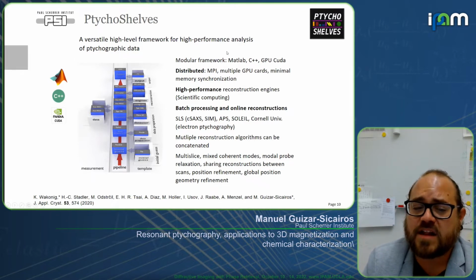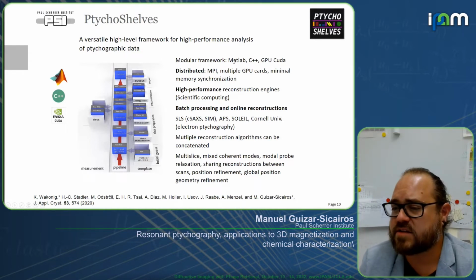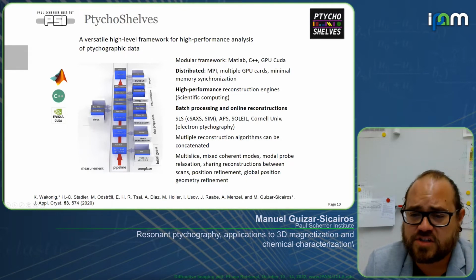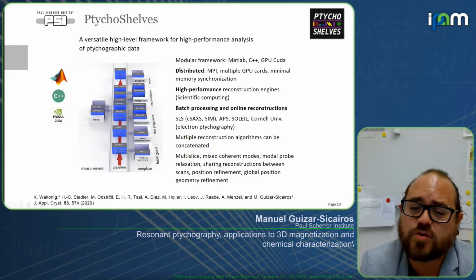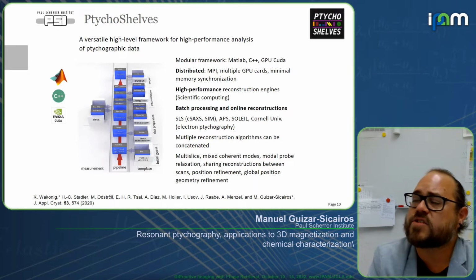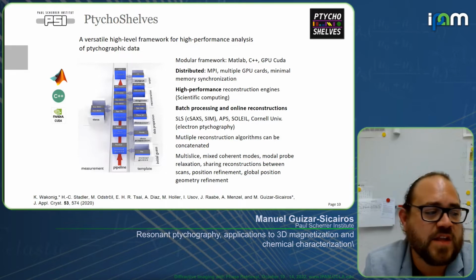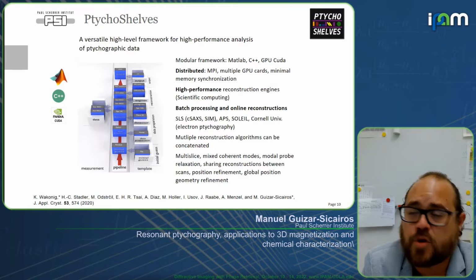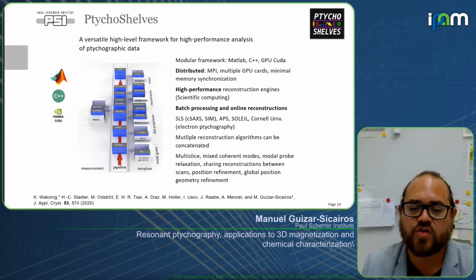It does use MATLAB as the front user interface, and behind it we have some optimized engines with C++ and GPU CUDA. It supports distributed computing, multiple GPU cards, at least with the C code, and it has different engines. Some of them are highly optimized by scientific computing here at PSI, and the other ones are prototype code, basically MATLAB and CUDA, that is easier for exploring new algorithms.